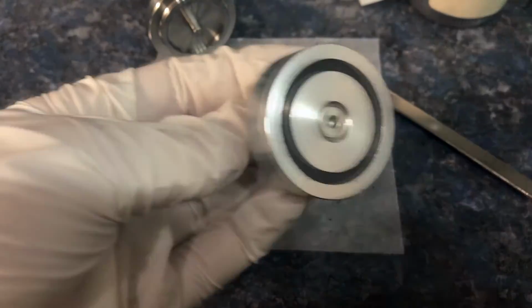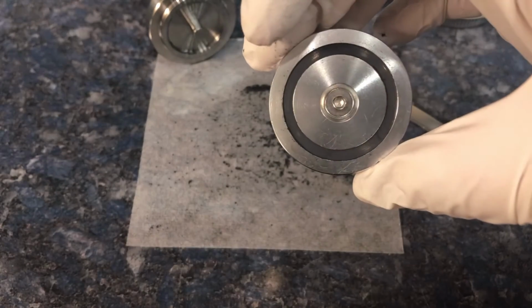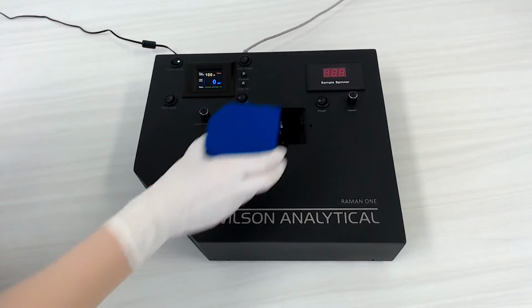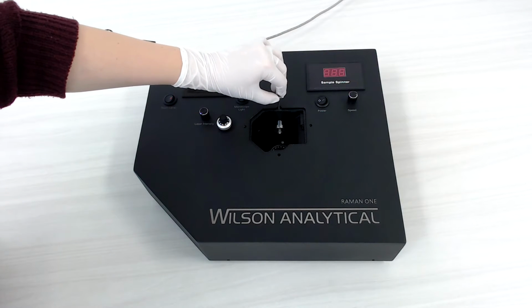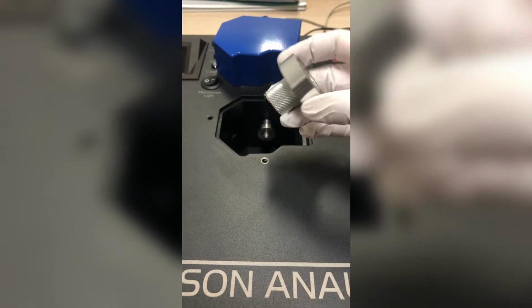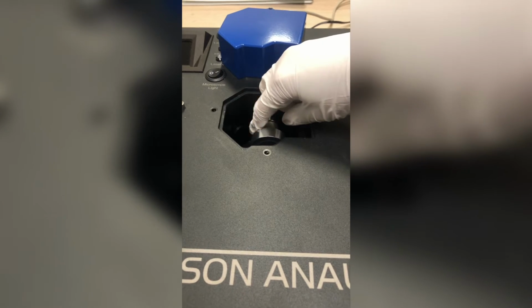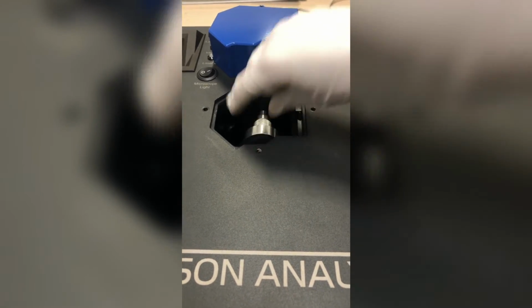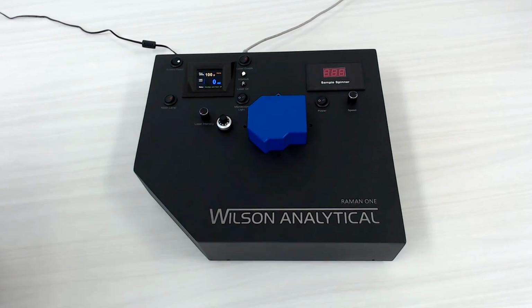We are now ready to place the sample in the Raman One chamber. To access the chamber, remove the lid and use the pin to hold the spinner in place. Spin the sample onto the threaded shaft. Next, remove the pin and place the lid back over the sample chamber.